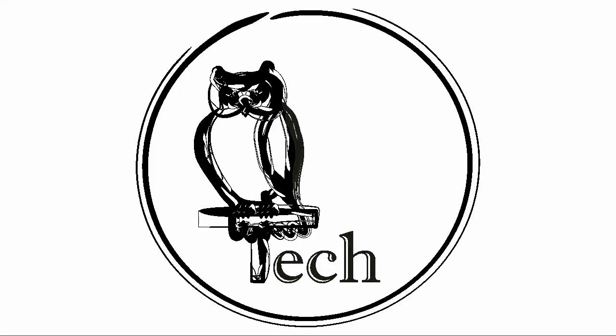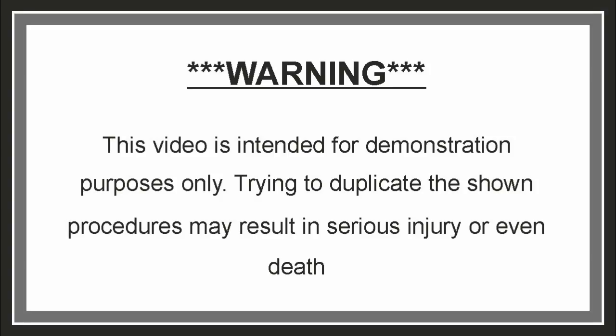Silver Stripping in Sodium Sulphite Electrolyte, Part 1. Electrolyte preparation and silver stripping warning. This video is intended for demonstration purposes only. Trying to duplicate the shown procedures may result in serious injury or even death.